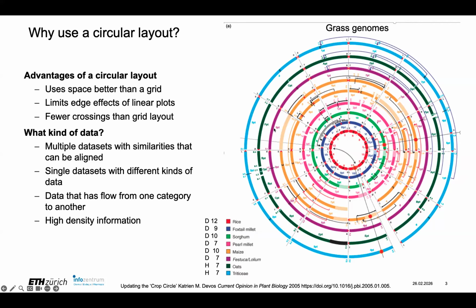And here I've aligned them such that the homologous portions of the chromosomes are aligned. So I can see very clearly that right here, there's been no rearrangements. A rearrangement is indicated here by an arrow, so I can see exactly where the rearrangements are and how each genome is related to the other one.